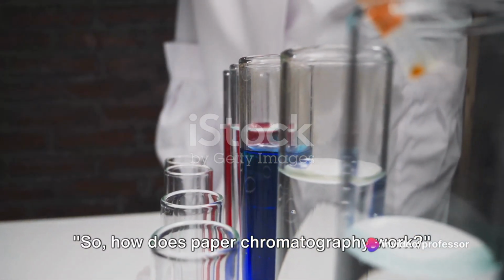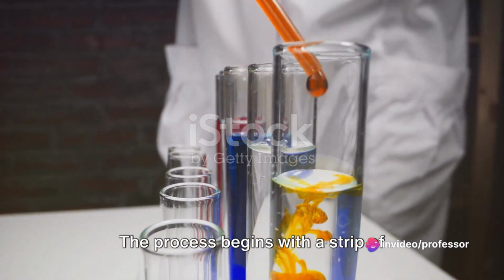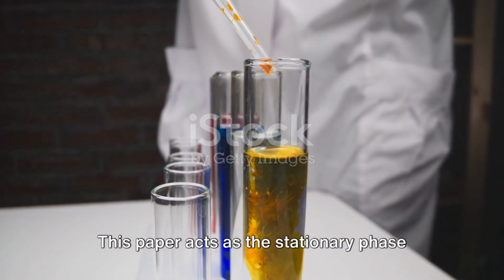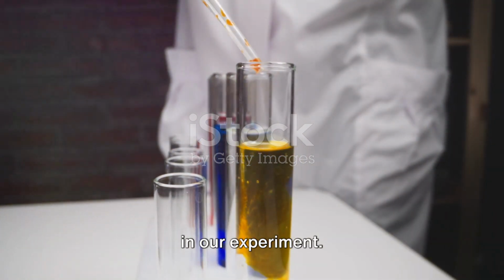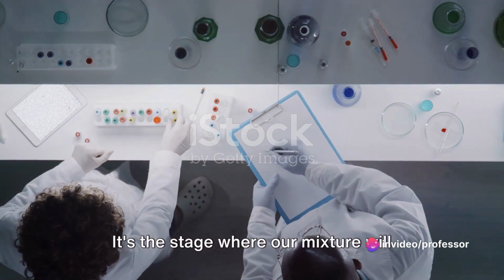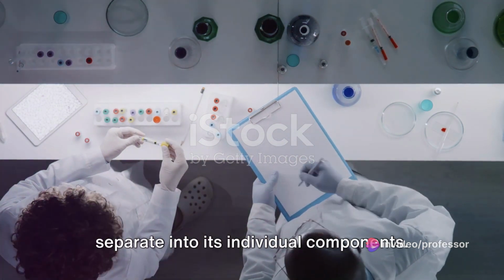So, how does paper chromatography work? Well, let's take it step by step. The process begins with a strip of high-quality paper, often cellulose. This paper acts as the stationary phase in our experiment. You see, the stationary phase is where the magic happens. It's the stage where our mixture will separate into its individual components.